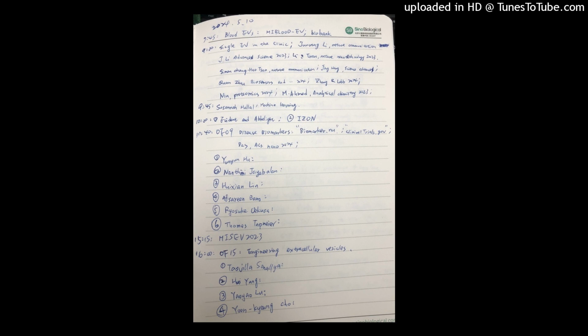Well, that's a real good question as well. I can just tell you that we're just finishing a very large manuscript where we show that it's possible to measure the same concentration of a particular type of cell-derived vesicle in blood plasma across different instruments, nowadays flow cytometers.